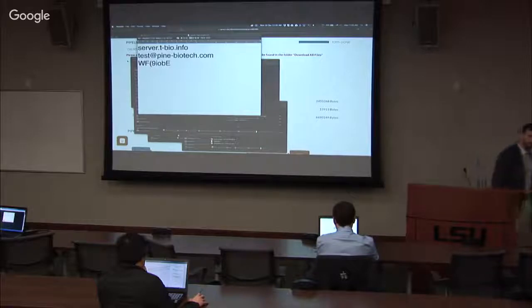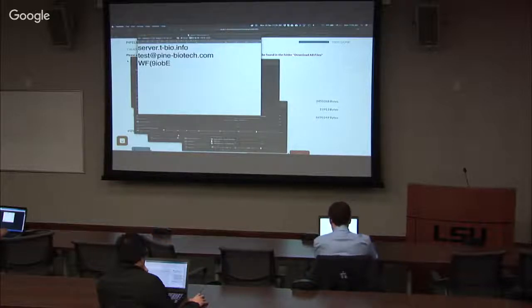It's like a conceptual question, dealing with the slides, I guess. So when we go into PCA, at first we're plotting the gene expression correlation, and then we look at the... It's not correlation. These are samples. The dots are not genes. They're samples. Well, at first, if they're genes, right? Well, it's a sample level of each gene.